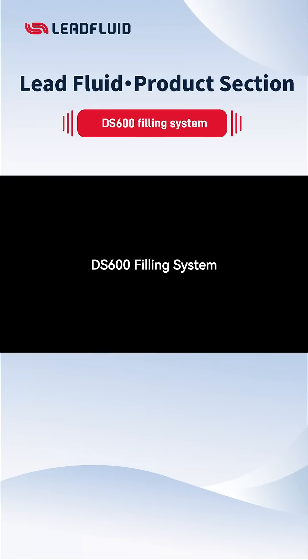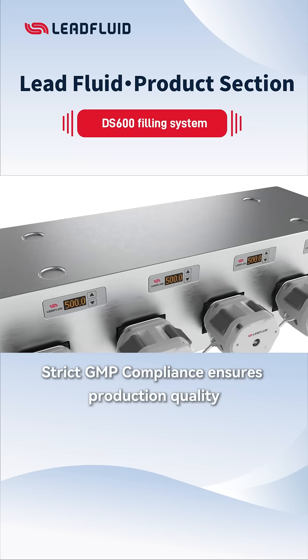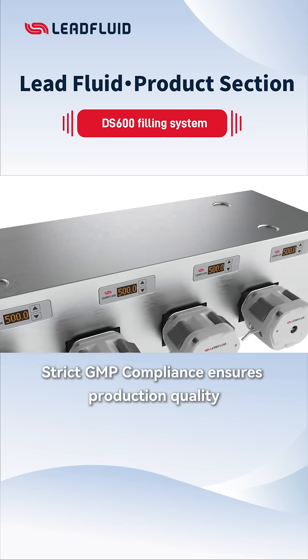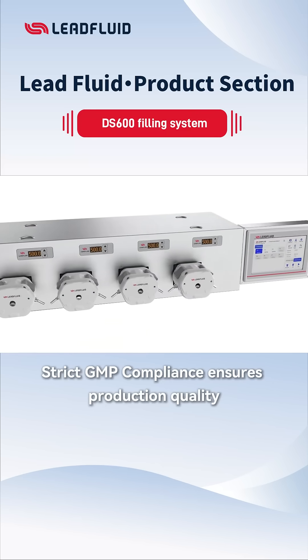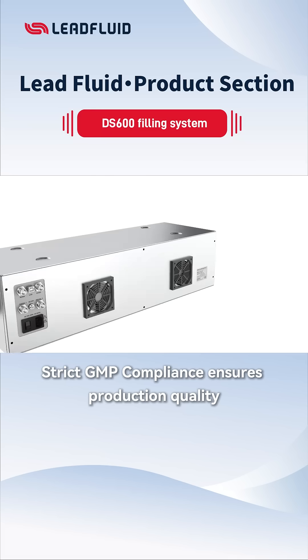The DS600 filling system, designed for pharmaceutical, chemical, and food industries, has received a comprehensive upgrade. It is made of stainless steel material with a simple design and no dead corners, effectively preventing cross-contamination. It strictly follows GMP standards to ensure production quality.